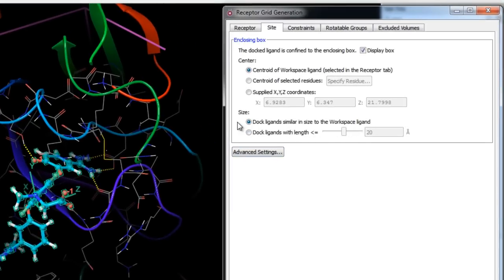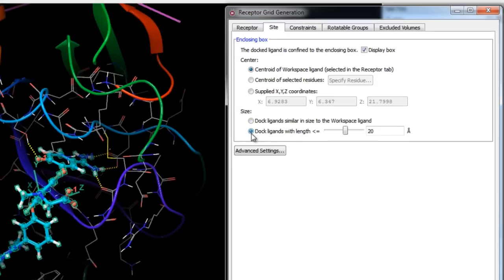The setup also assumes we'll be docking ligands with a similar size to the workspace ligand. This is ideal when you have a representative ligand already in the active site, as it automatically adjusts the enclosing box to the dimensions of a known ligand binder. If conformations of active ligands may be significantly larger than the co-crystallized ligand, consider enlarging the enclosing box.